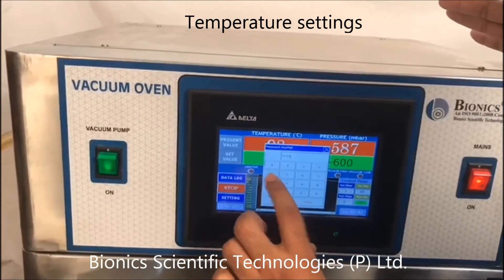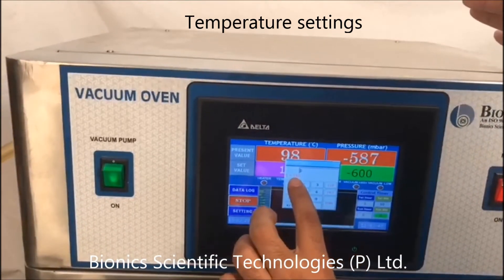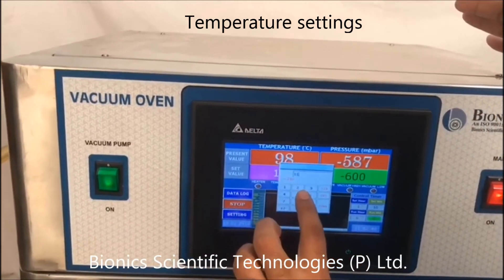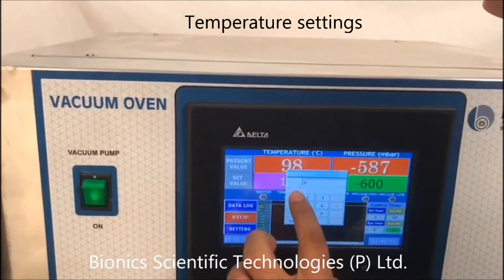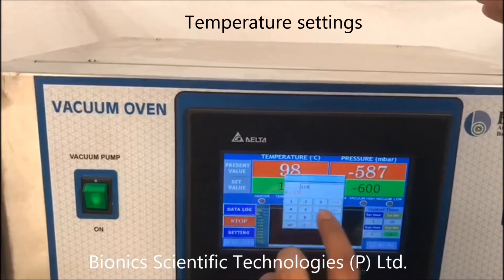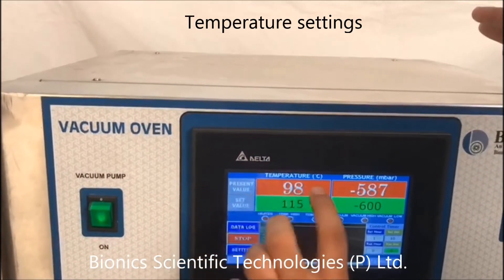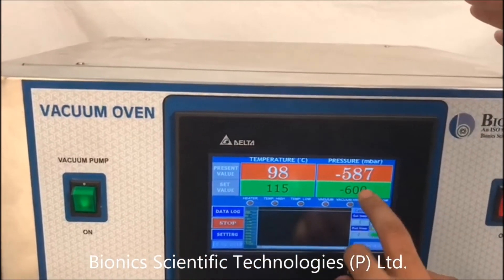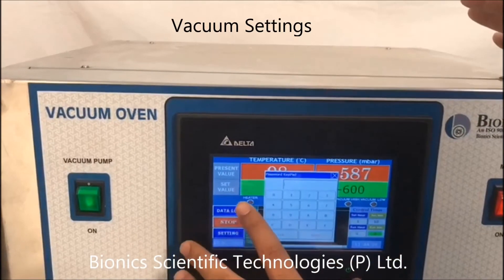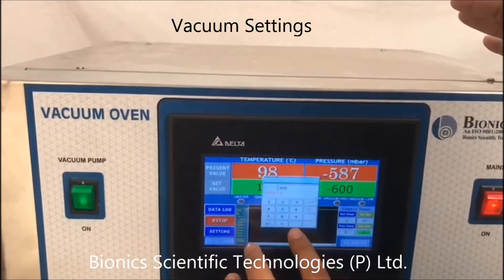Enter the password. The present value is 98, the set value is 150. Same for this vacuum — enter the password and tap here.